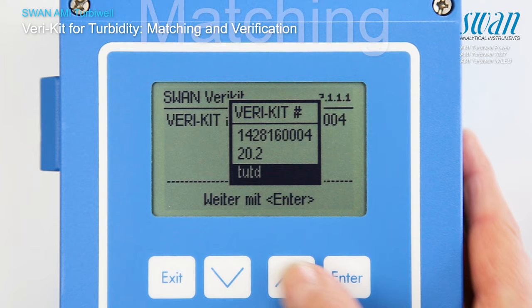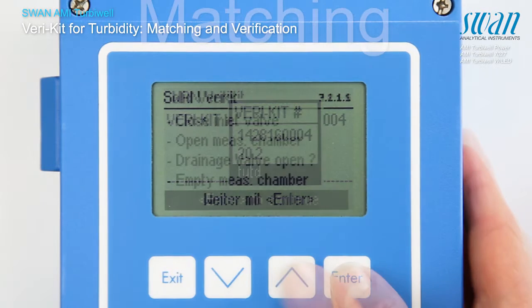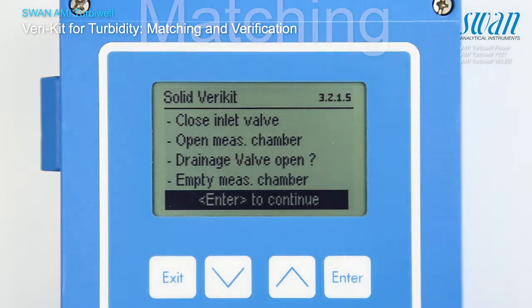All matched varikits show up on the list and can be selected to repeat the matching. Proceed as shown on the display.